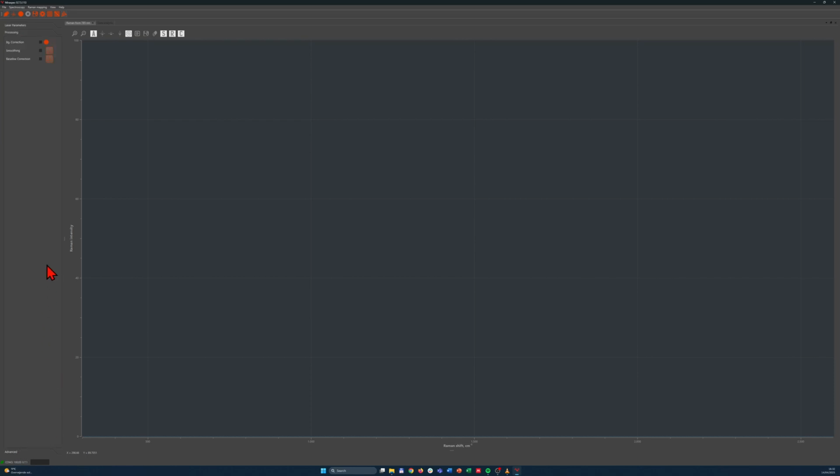Then there is automatic processing during acquisition. Usually I'm not using that, but some users might be interested in that. For example, background correction. With background correction, we can record the background with this round button, and then we can click on the tick to apply the background correction.